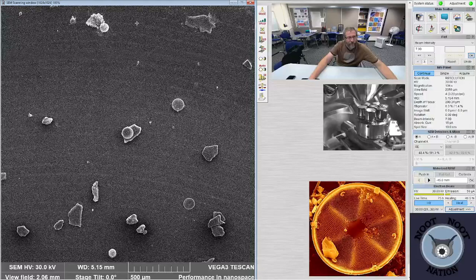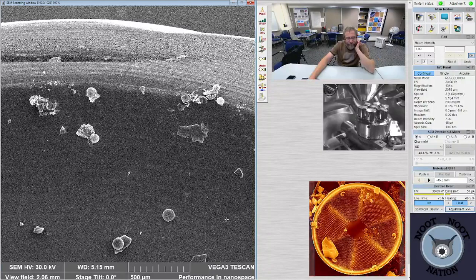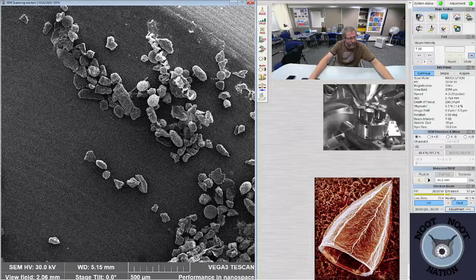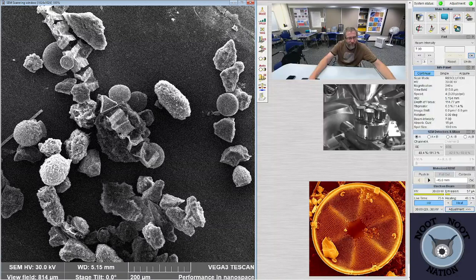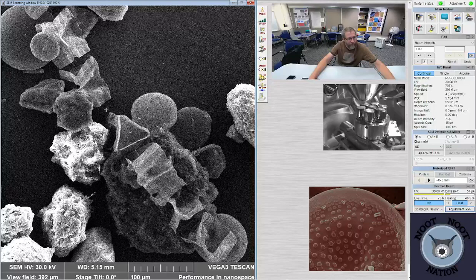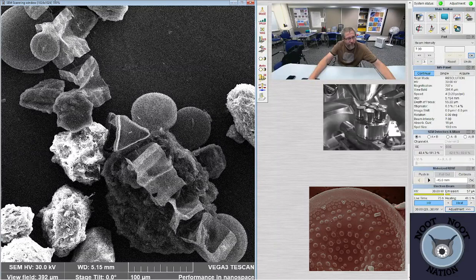The live samples are nice because they allow us to see diatoms living in colonies, like this one, and also lightly silicified things, or things that would dissolve very easily. So this is an example. You can see this was connected to that at one point. You can see the colony right here, and it continues all the way up through there. This is a piece of a long colony of diatoms, just one aspect of it.